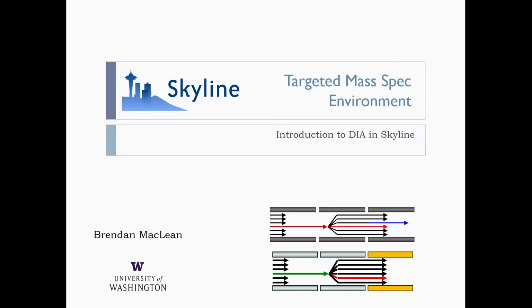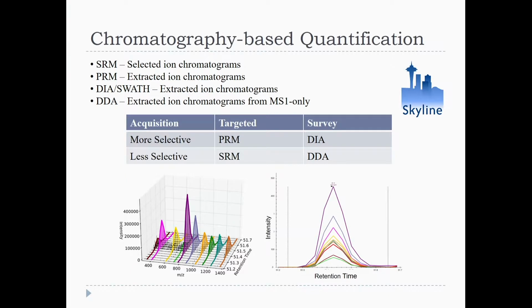It wasn't long before I had been working in proteomics, and I was really excited. We had a very engaged set of users in the CPTAC program, which was the National Cancer Institute in the U.S. But then all of a sudden I went, wow, this is a really small market. We're one of the leading targeted proteomics labs, and we have one triple quadrupole instrument in our lab, and most of the people are the same. So part of growing what we can do with targeted proteomics was moving into these other areas.